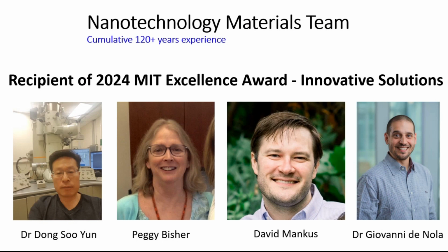So I guess the challenge of the ice contamination in this particular transfer is that it's a little bit of a stealth challenge, because sometimes you would see ice build up on the surface of your grid when you go into the FIB-SEM, and you know immediately, let's just stop here, the grid's trashed. But what you might not know is that a glacier has formed underneath your grid.